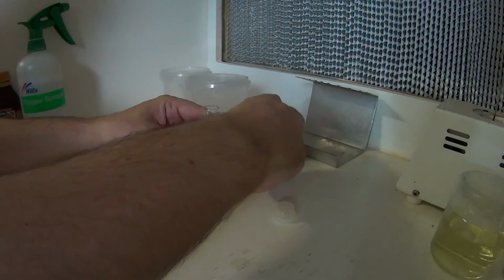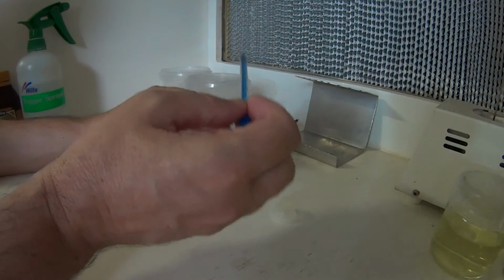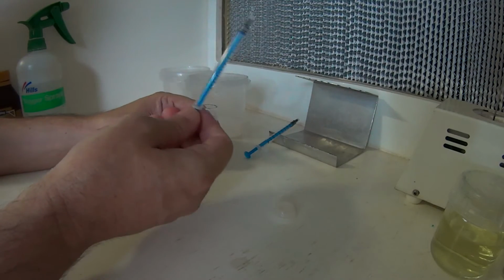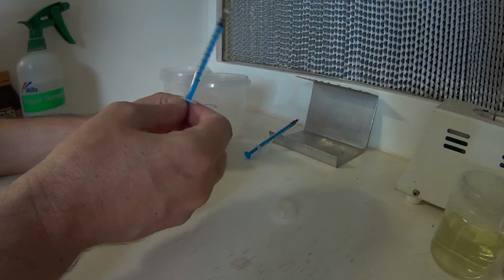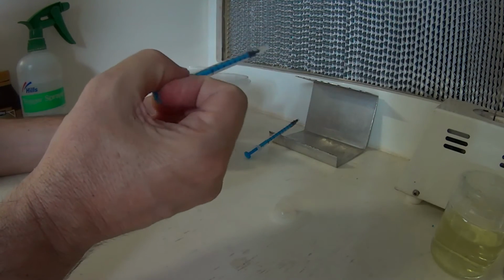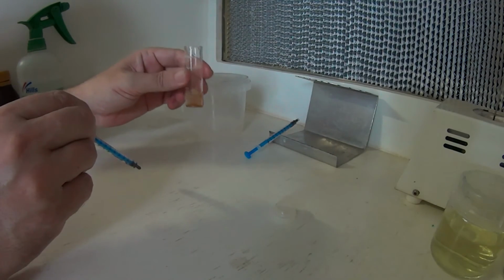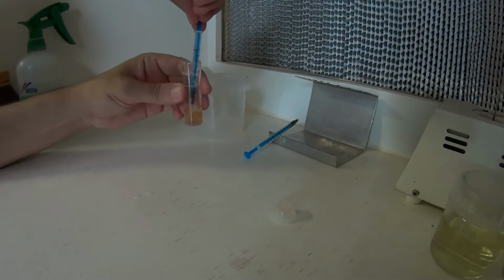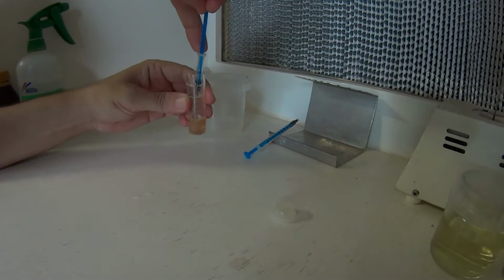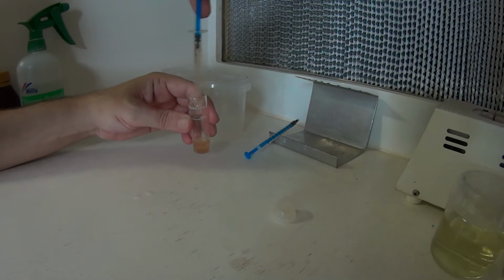Alright, so simply remove the lid. Now I've pre-sterilised these. You can do it in your autoclave or your pressure cooker and wrap them up in foil, or just give them a good soak in alcohol and let them dry out, which is what I've done. Right, so like I said, we need to keep this a little bit agitated as we suck a little bit up so we can get some of these orchid seeds. So just give it a good agitation and we'll suck some up in there.